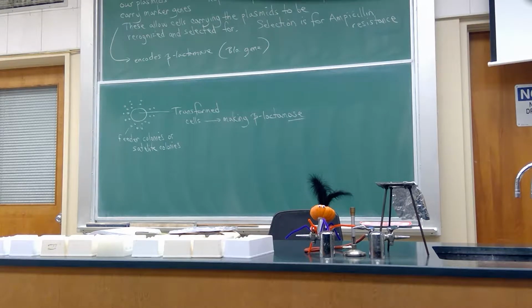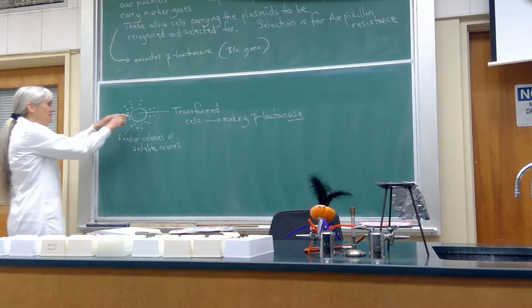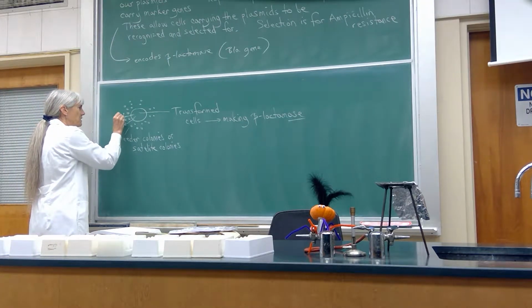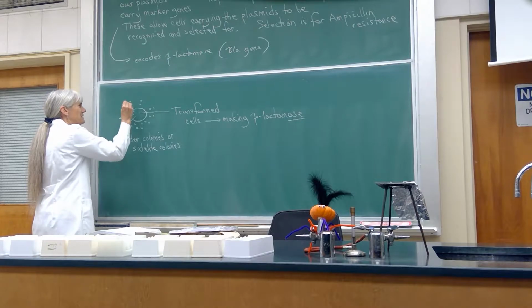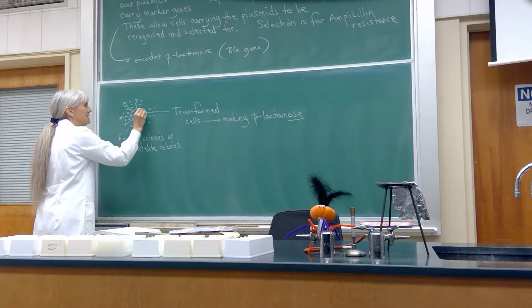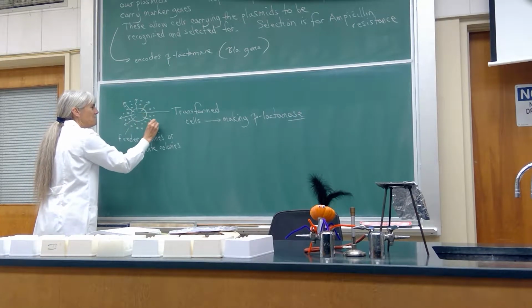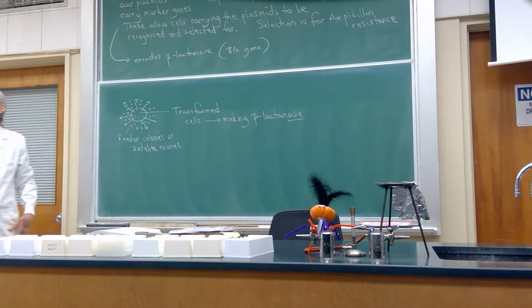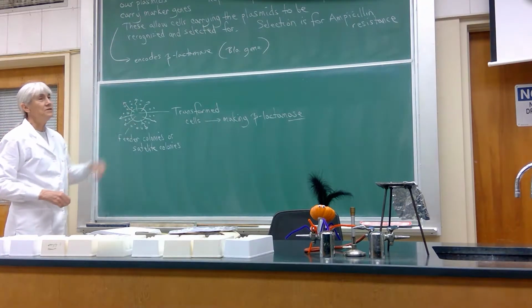In this case, it's breaking down ampicillin. This colony is producing this substance, and it's going into the medium. What does that tell us about beta-lactamase? Is it an endoenzyme or an exoenzyme? Exoenzyme. They're dumping it into the environment, which is then going to allow the little feeder colonies to show up.